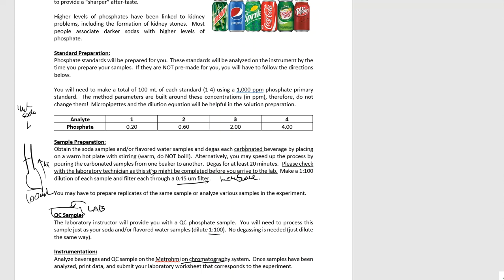You can make your batches, and then you can run your batch and come back on the next day or come back a little bit later to print off your data and begin to analyze it. That's all that there is with the lab. All right, it's as simple as that.